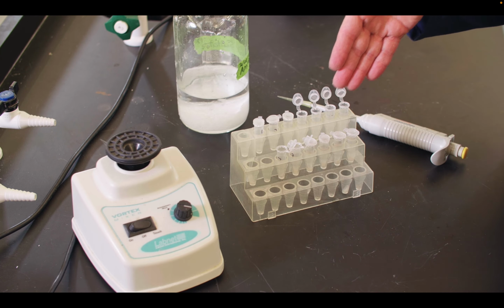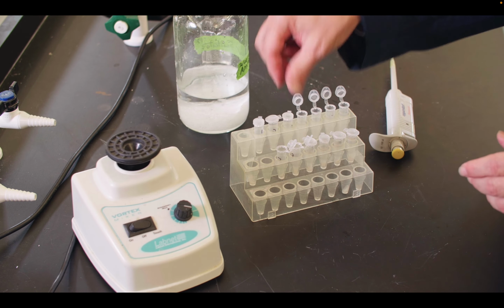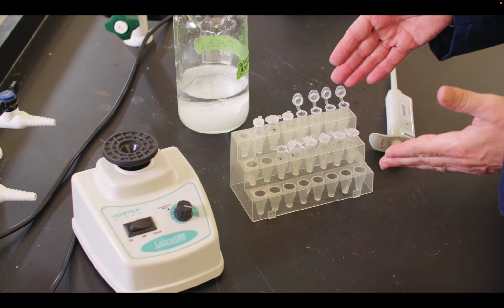So I'm going to continue on with 4, 5, 6, and 7, adding 20 microliters each time from our tubes where we have that aliquoted off. Each time, picking them up and making sure we stir them. And once I get to the end, I'll start over and keep adding 20 microliters. It'll take different amounts for each one of these because they have different amounts. But we'll go ahead and continue to do that.